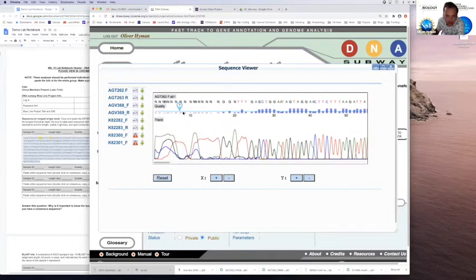So I want to draw your attention to this quality area right here. So the blue line and the purple bars. You can hit this little question mark, and that explains what the bars are and what the line is. This is very nice for you and for students if they're having questions to be able to click on this stuff and remind yourself what's going on here. Rather than just read that to you, I'm just going to talk you through.